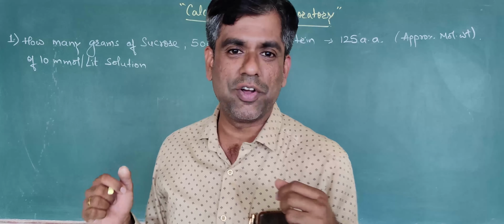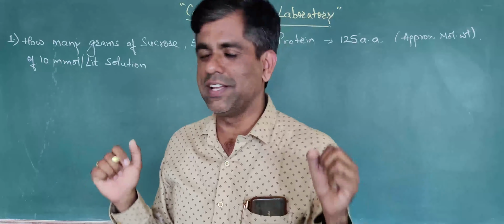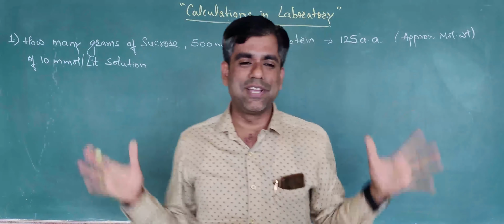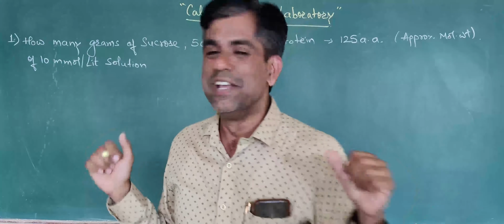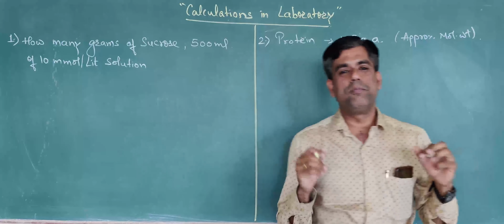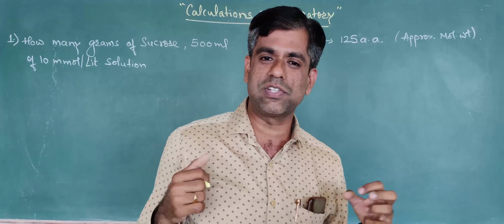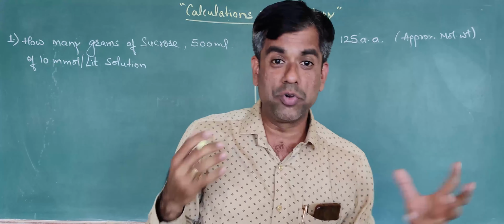We generally rely on some ready-made solution. Whenever we enter a laboratory, the one thing which makes me very happy is that the reagent is prepared by yesterday's batch and you can use it as it is. That really makes us very happy, but we don't get this happiness every day. Most of the times, we need to prepare the various solutions in the laboratory. So let us see how to prepare these.